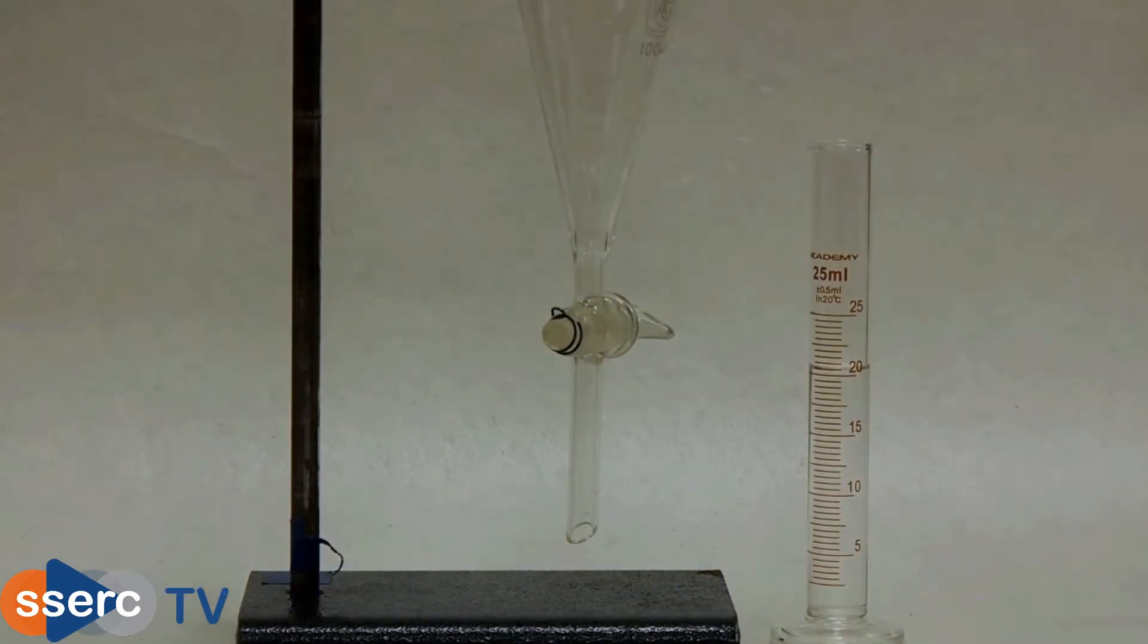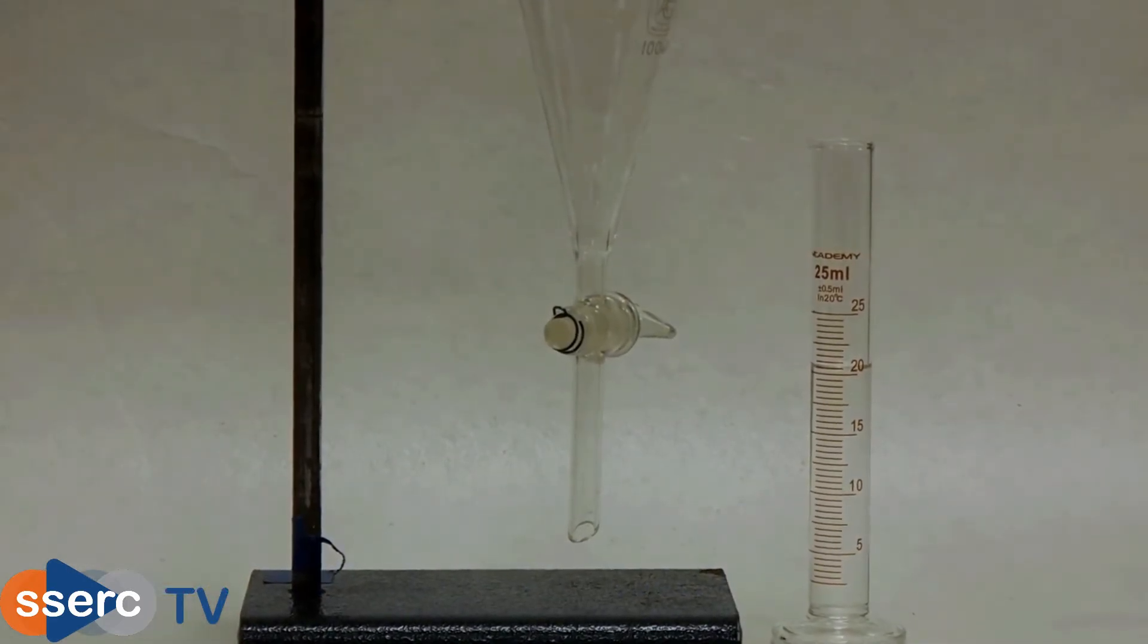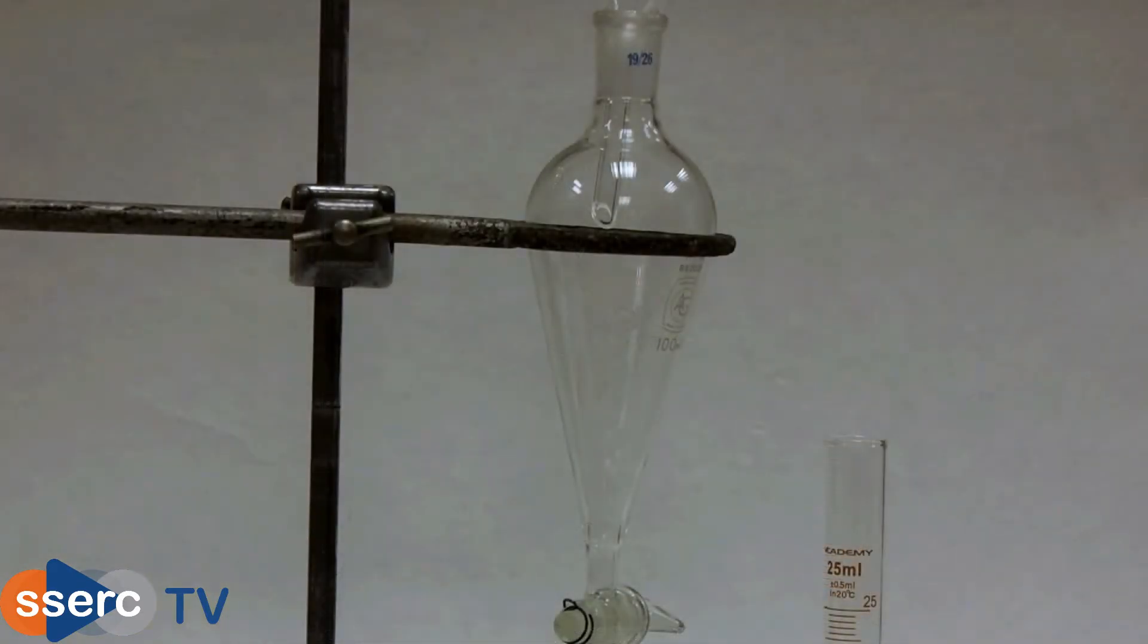Now we need to extract the caffeine from the solution. For this we need a separating funnel like the one shown here. Make sure the tap at the bottom is closed and pour in your aqueous caffeine extract.